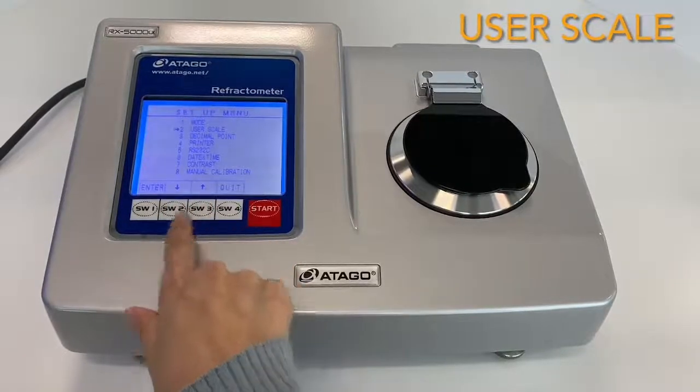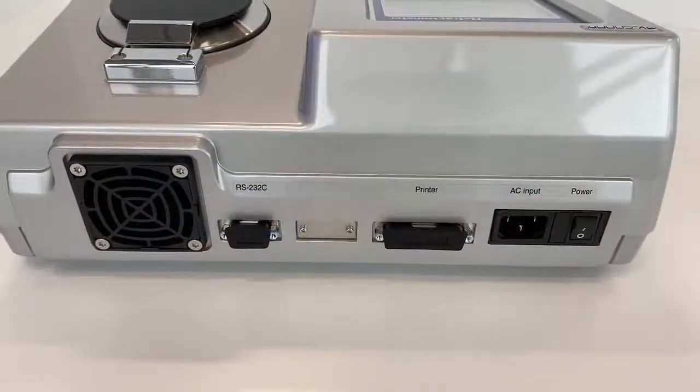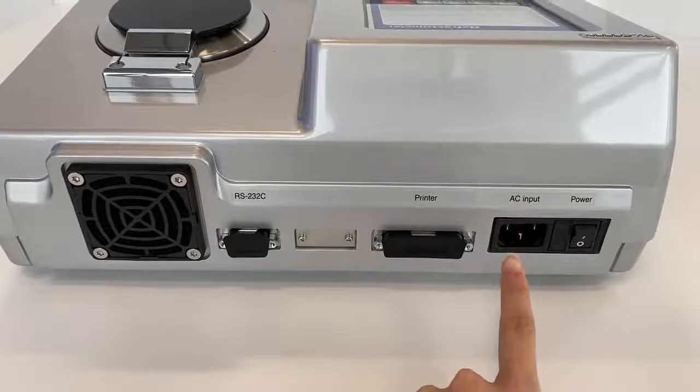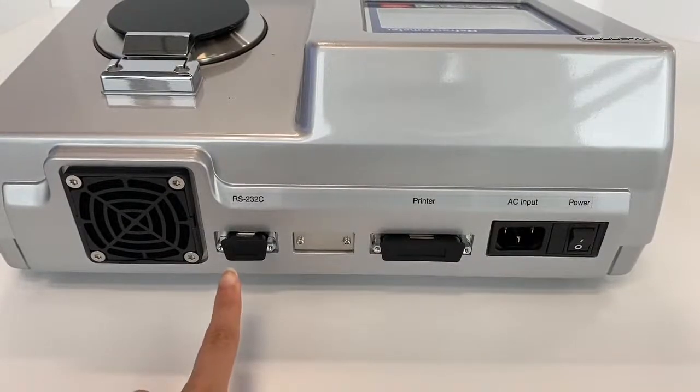I will explain a little about the user scale. You input a sample name, refractive index, and data of the sample you want to measure. This RS-232C connector is the data output for Rxα.